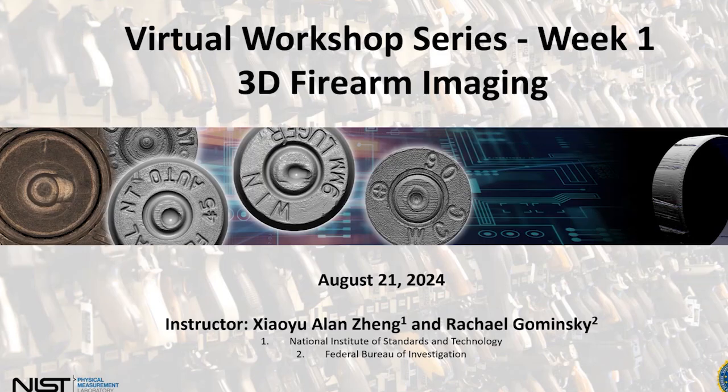So my name is Zheng. I'm a mechanical engineer at the National Institute of Standards and Technology, or NIST. And Rachael is from the FBI, and she's been instrumental in helping us really test out all of these different instruments and also understand the quirks of each, let's put it that way, and figuring out how best to present the information to operational laboratories for capturing these 3D images. And I did see some familiar names in the attendee list, so if you've ever been to one of our NIST workshops at AFTI, you may be seeing some repeating information, but Rachel's presentation is relatively new, so I think you'll gain a lot from that as well.